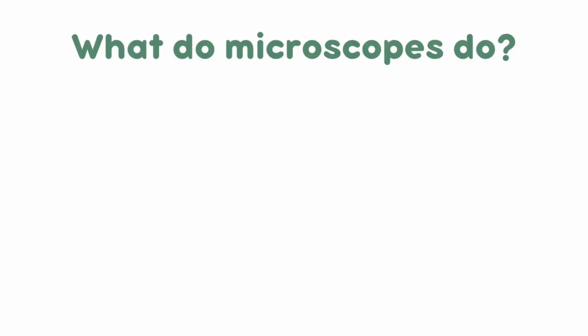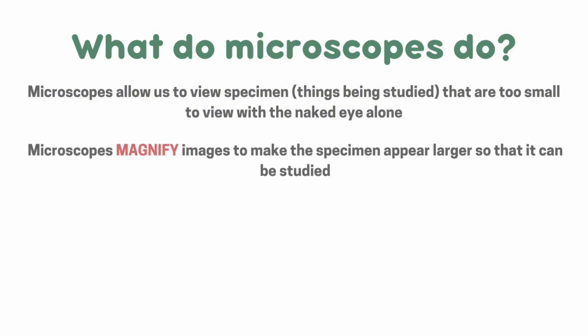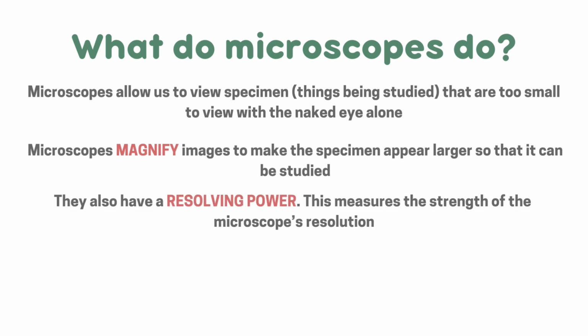So first up, what do microscopes actually do? Microscopes allow us to view specimens, which are things being studied, that are too small to view with the naked eye alone. Microscopes magnify images to make the specimen appear larger so that it can be studied. They also have a resolving power. This measures the strength of the microscope's resolution, visualizing the specimen.